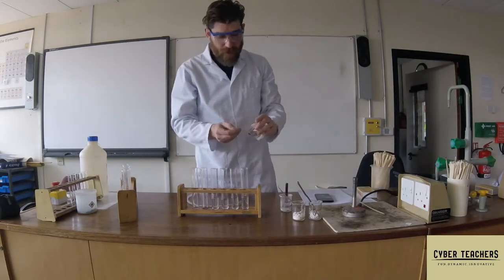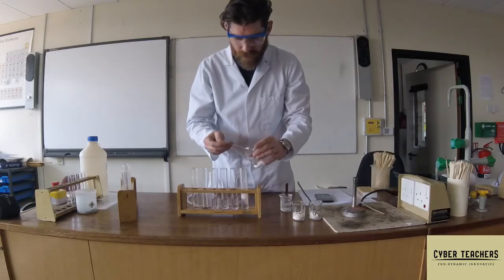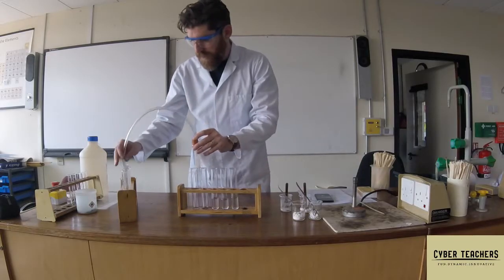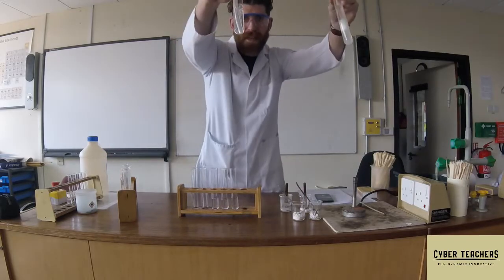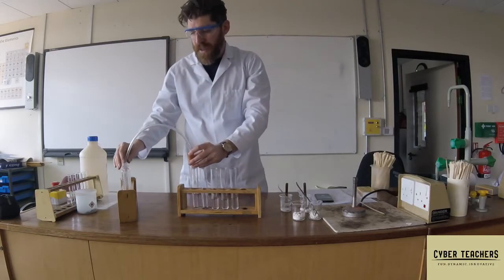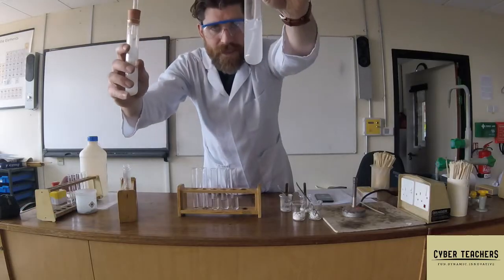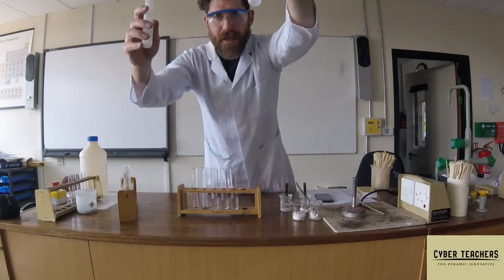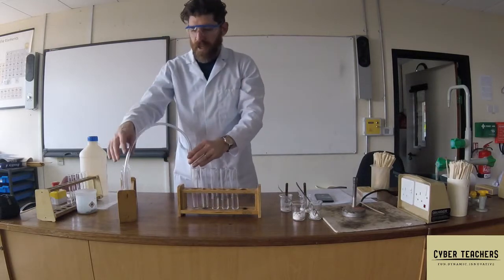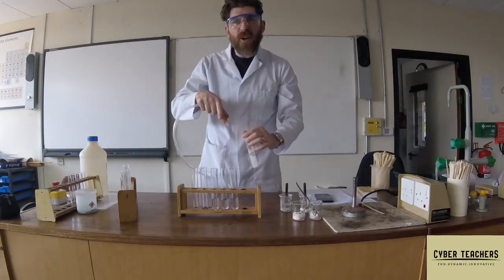I'll pop this in here and we can see a reaction happening straight away. We'll put this into the lime water and you can see it's bubbling away nice and vigorously. We can see that it's turned the lime water cloudy, so that's a positive test for carbon dioxide.